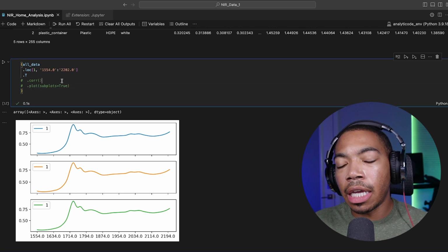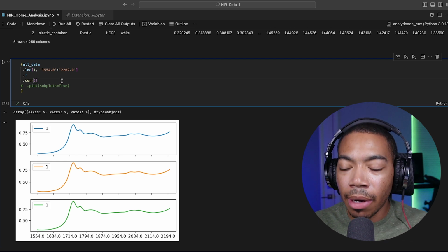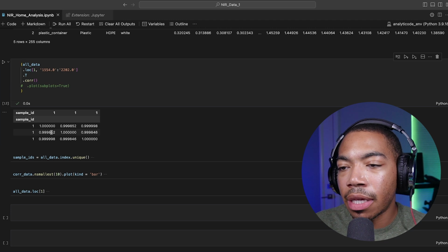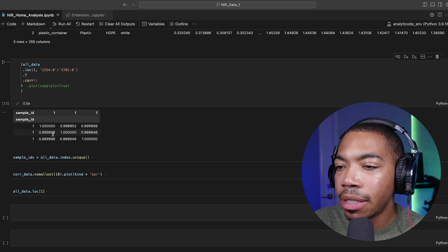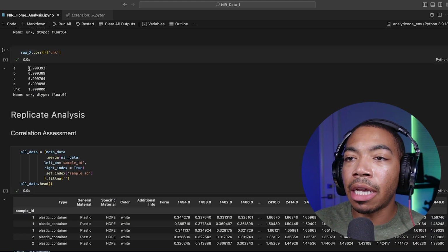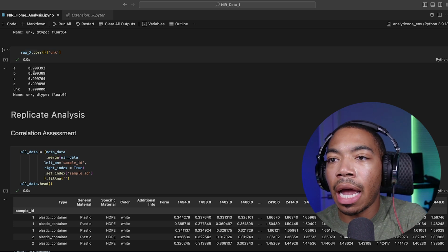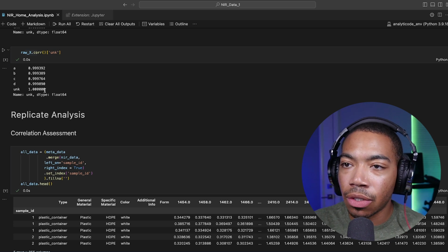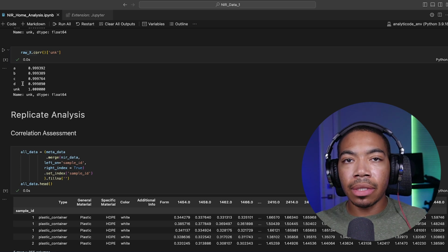And so one thing, again, about chaining these methods is that we can pretty easily switch the method out. And so now let's look at the correlation amongst these samples. And we can see that these are correlated. If we look at the minimum correlation across each of these, we're looking at 0.9998. And so this, again, is what I was talking about when I was identifying this becoming an issue, is that these correlations are on the order of the correlations of a highly reproducible measurement. And so we do want a way to gain more confidence in the sorting by splitting these out in this case, but we can also leverage this idea for assessing measurement quality.